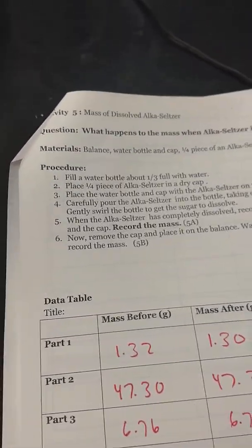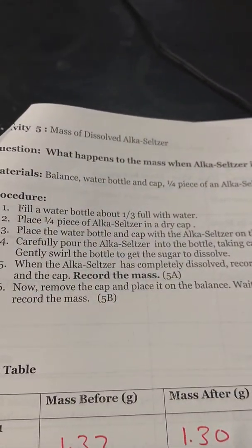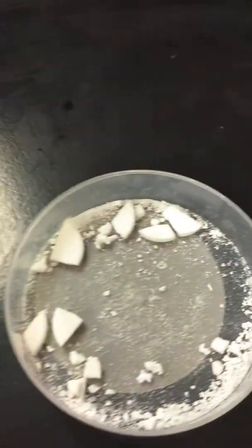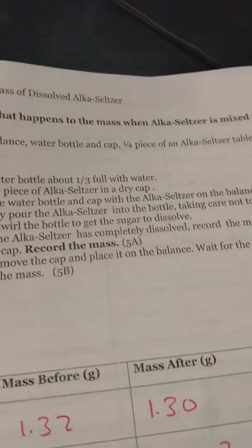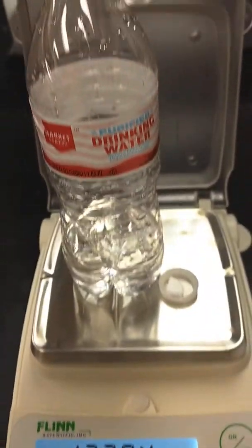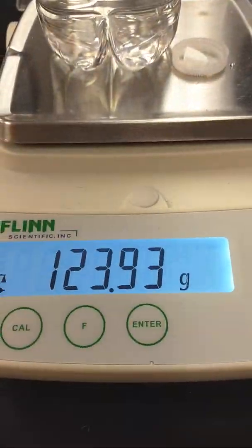Now we're on the last part, which actually has two parts to it. You're supposed to get the water bottle, which I've rinsed out, fill it again a third full, and then put a piece of Alka-Seltzer — already cut into fourths — into the dry cap. First I have to mass it, and then I'm going to add it to the water and see if there's a difference. So there's the water, there's the Alka-Seltzer, there's the mass.